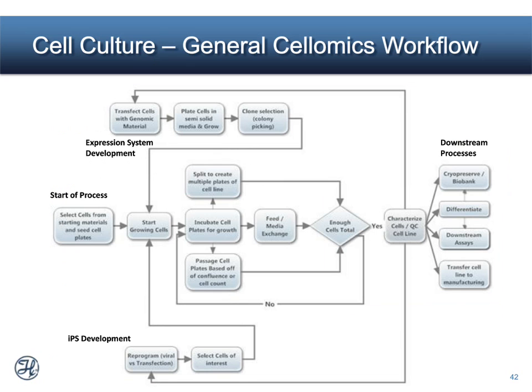would handle the growing of the cells, control the incubation of the cells through a period of time that they need to grow, handle the media exchanges on a regular basis, allow passaging of those cells when they become too confluent, or they need to passage them for a cell-based assay. And then to the point where, do we have enough cells for our cell-based assay, or do we need to continue the process through the cell culture maintenance?